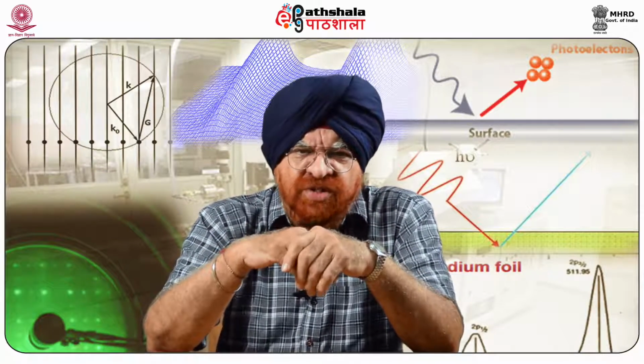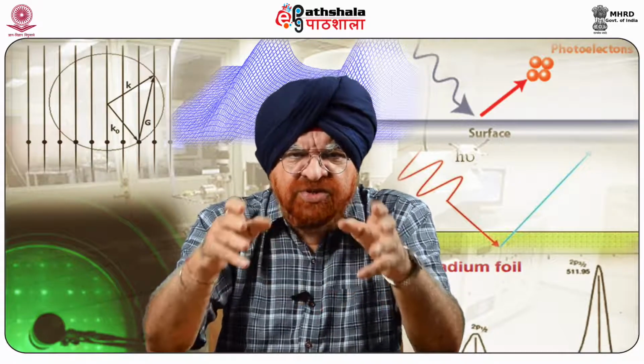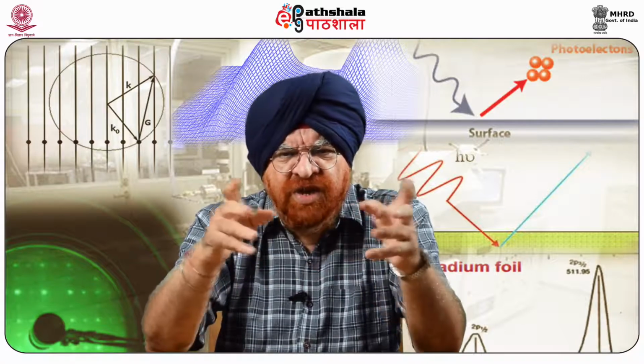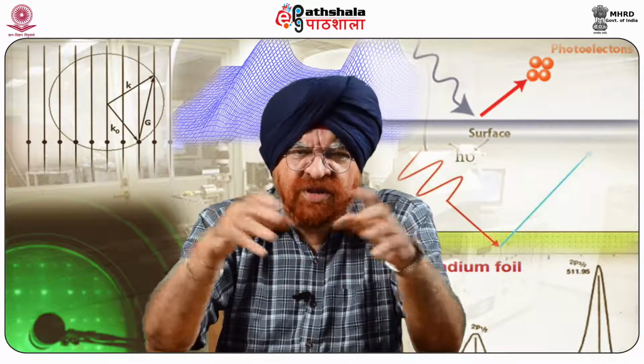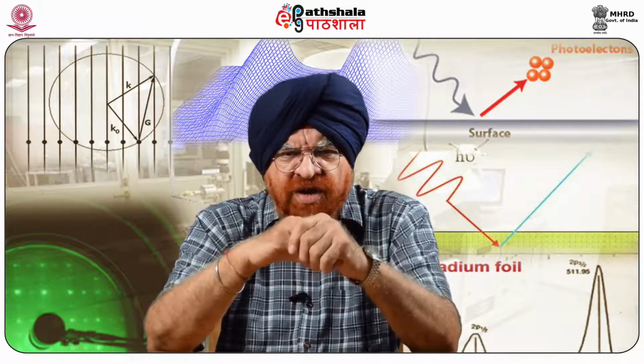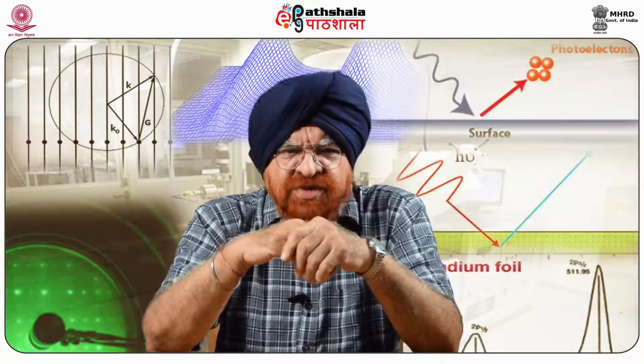So, having studied all this, students, I'm sure you would have appreciated a great deal about the potential of STM and the vistas which this equipment has opened for electrochemists doing research into many areas like corrosion or batteries or biologically related electrochemical processes.